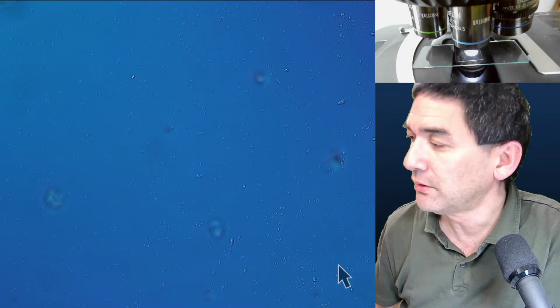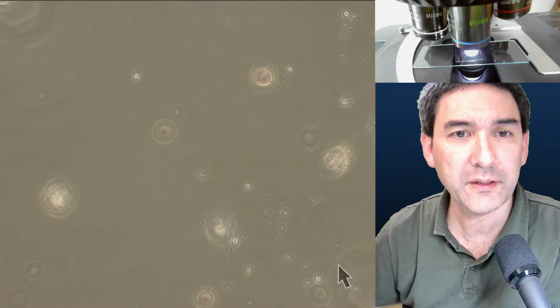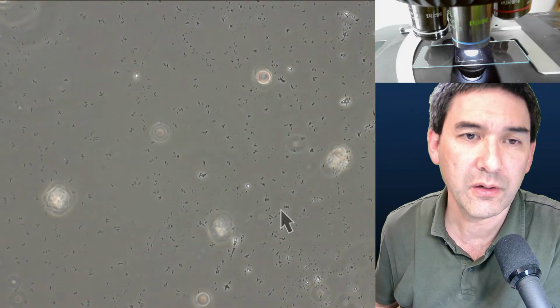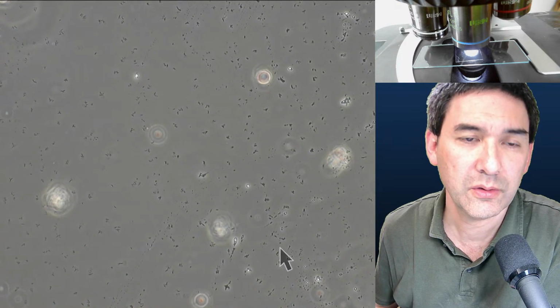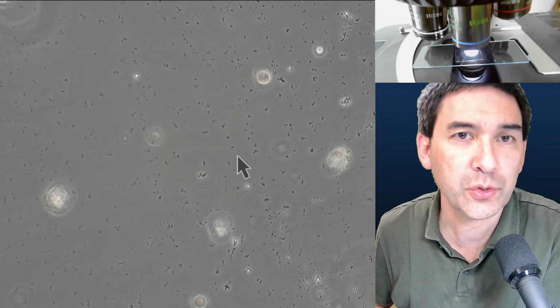And in phase contrast, remember the one that increases the contrast a little bit? I have to open it. I forgot to open it. Now you see those tiny dark dots here. These are the bacteria. They're not moving around because they need some time to regenerate, because they were just freeze-dried.